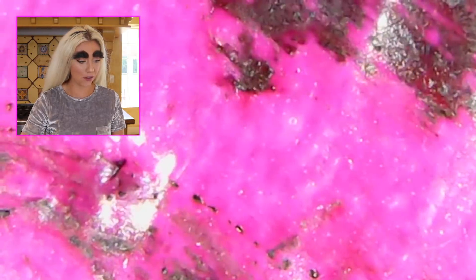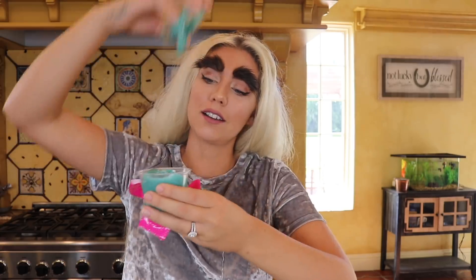My finger looks way more disgusting. Let's take a look at this slime smoothie — let's see what the duct tape looks like first. Look at that — that's the ink, this says 'smoothie' right here. That looks crazy. This is the smoothie part. Let me open this baby up — that is super sticky right there. Actually, it really isn't that bad. This kind of smells good — it smells like a Yankee candle. Nothing too funky really going on with this slime. That's a giant foam bead right there. This slime is boring — let's move on. I think because it's such a solid color you can't really see details in it that well.